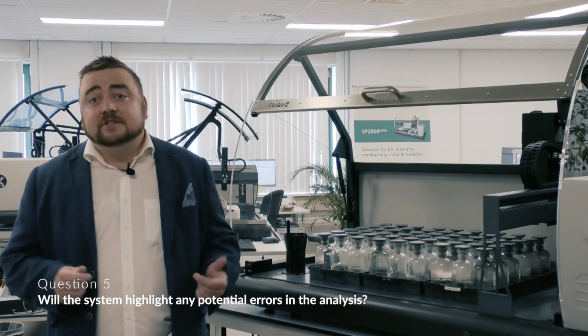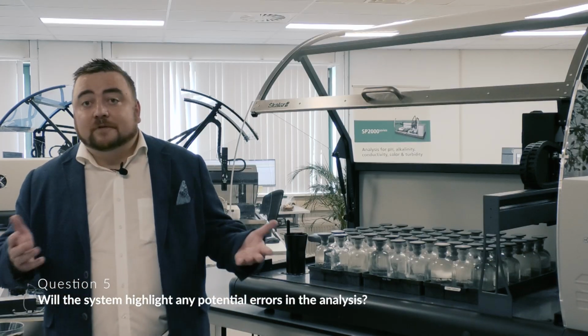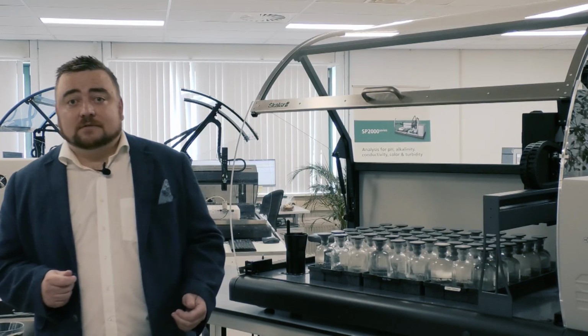Which brings us lastly to question 5. Will the system highlight any potential errors in the analysis, and will it select the best results for reporting? So yes, in principle. The most common practice, traditionally on the manual method, is that you would report the result which used the lowest dilution factor, which just means that any potential error from within that manual procedure is multiplied by a smaller number.